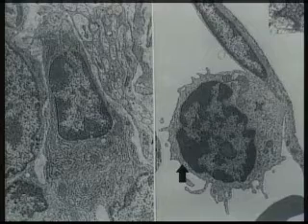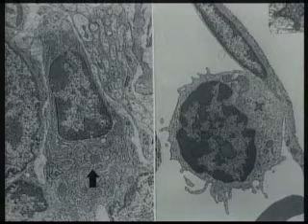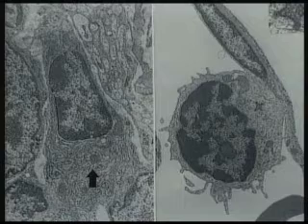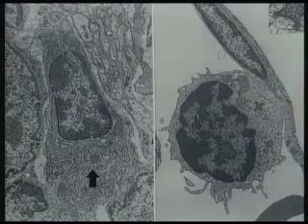This is the young circulating B lymphocyte here and the mature plasma cell into which the B lymphocyte grows and differentiates with time. Now I think you've got a fairly good grasp of the light microscopic and electron microscopic appearance of cells. Let's let you test your knowledge here with a practical examination, which will come up next.